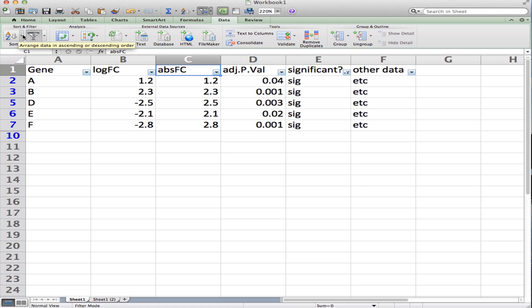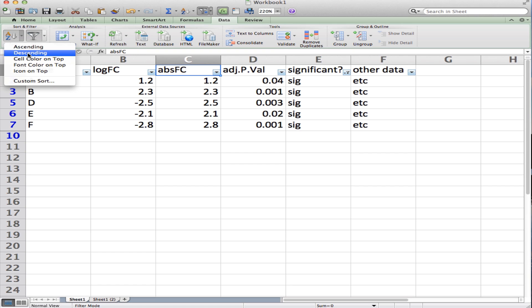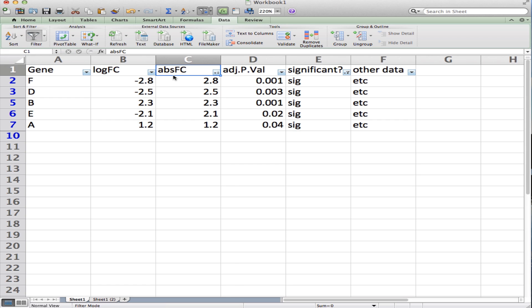If I sort descending, this will put the highest absolute value of the fold change at the top and decrease to the bottom. So this is showing the most differentially expressed genes from the highest fold change to the smallest, only for the genes that are statistically significant.